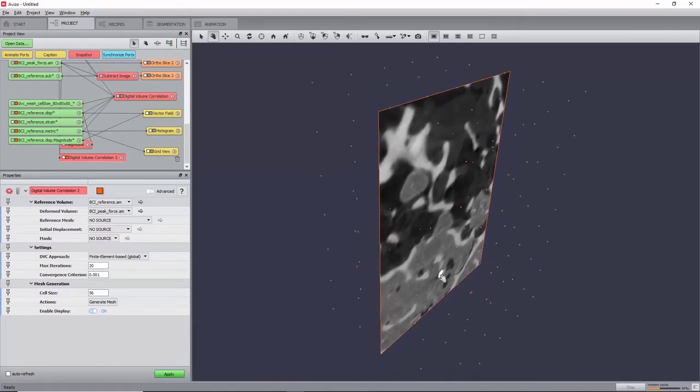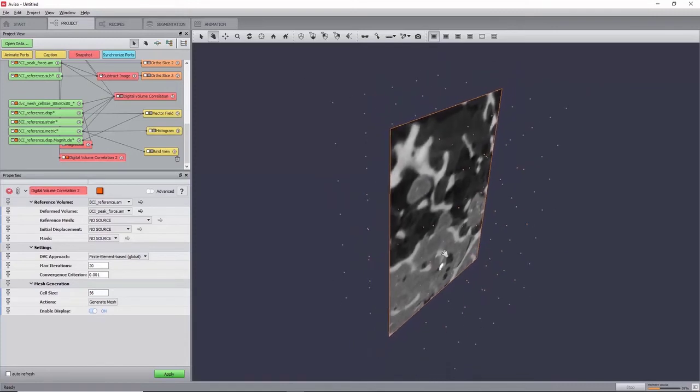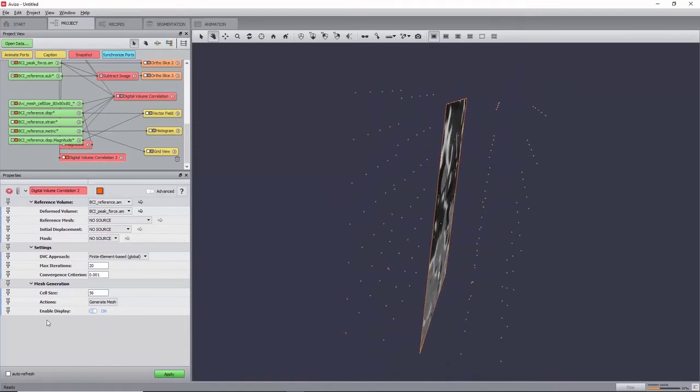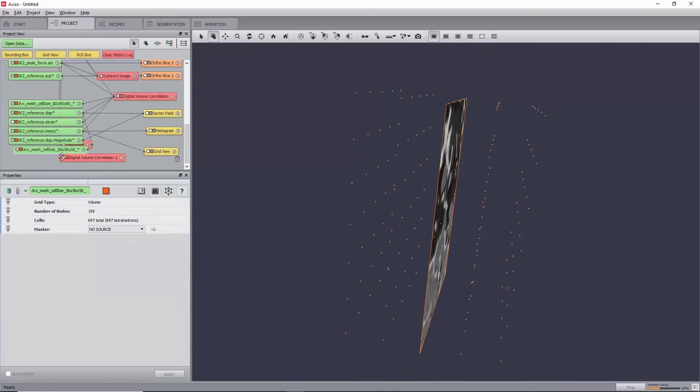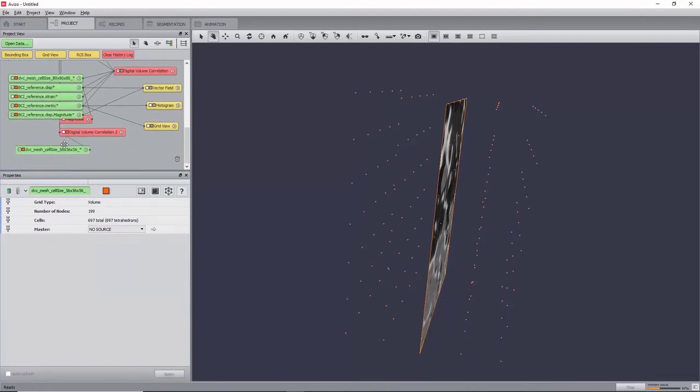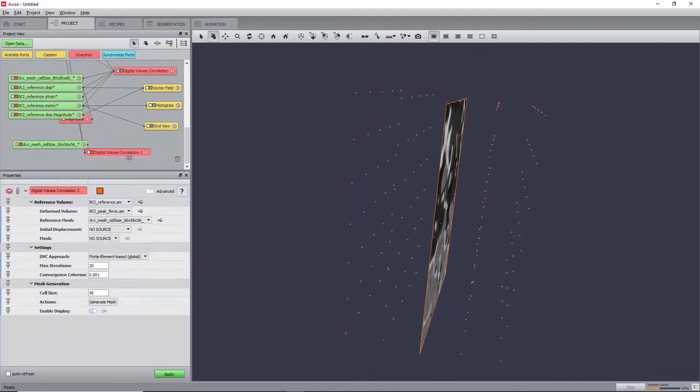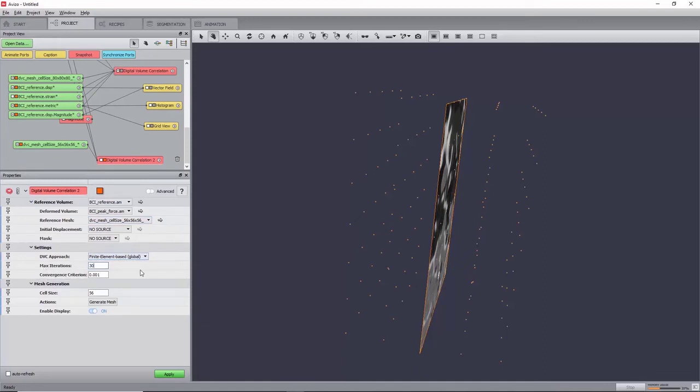Click Generate Mesh to create it, and it will directly be linked in the reference mesh port. With the DVC approach port set to finite element-based, set the maximum iteration port to 30 and keep the conversion criterion to 0.001.